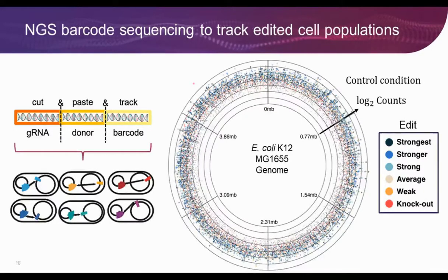For sequencing, we typically pool 5 NGS libraries on each MiSeq run, thus sequencing 7 runs on the MiSeq with 1 × 75 base pair setting for this study. So here you can see how the population behaves in the control media. It seems like the stronger promoters give a bit of an advantage in general, as the normalized counts are increasing with increased promoter strength.